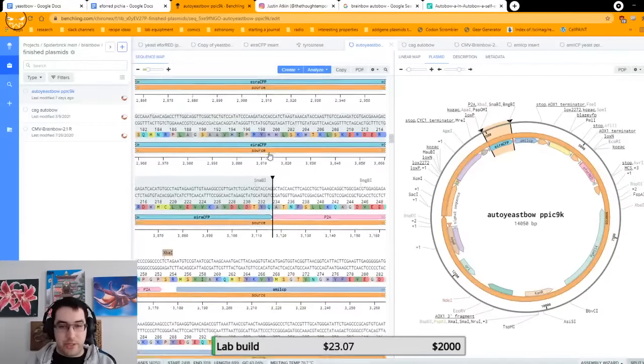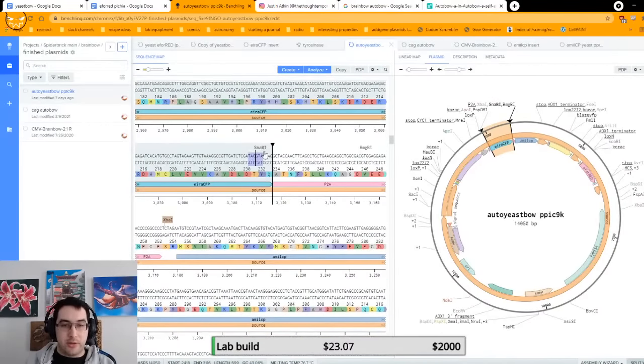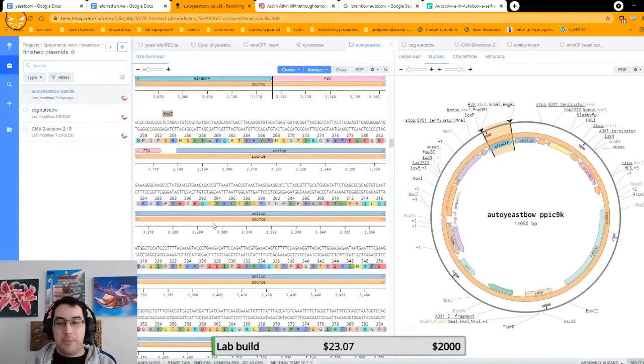And if I scroll down, you'll see that there's another one right here. And there's another one over here. I put a restriction site, a different restriction site, on the end of every single one of these proteins. This is very cool.